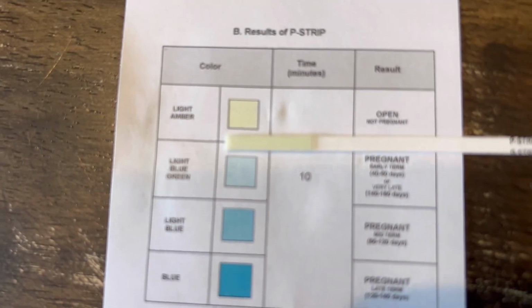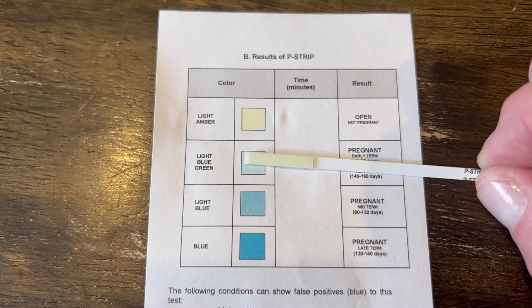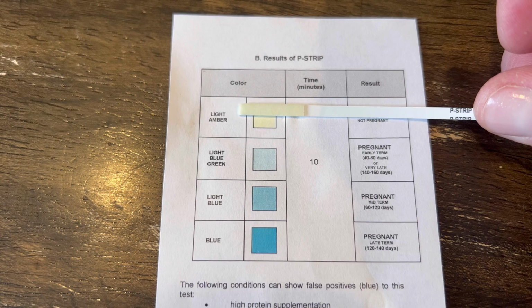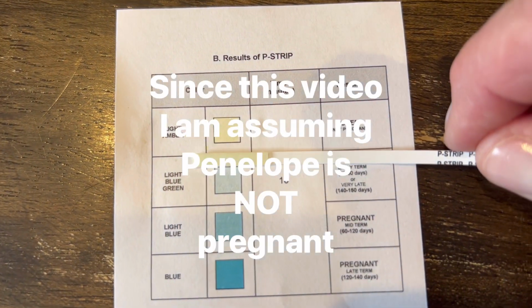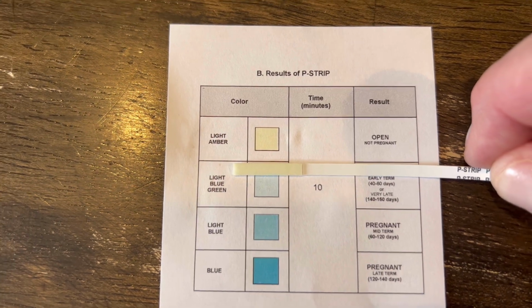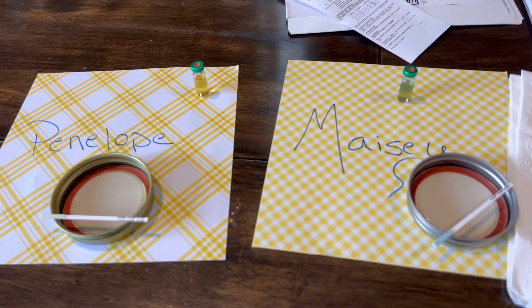I don't know. Actually, it's beginning to have a blue tint where it did not have a blue tint a minute ago. It was exactly that same color, but you can see now it is changing. It's no longer exactly that color. And it isn't light blue either, but it does have a tint. I don't know if you guys can see it on the camera or not, but there is a tint to it that was not there a second ago. And I'm noticing the tint because it's so different from the yellow. Yeah, so I'm going to let her sit again for a few more minutes and see what happens.